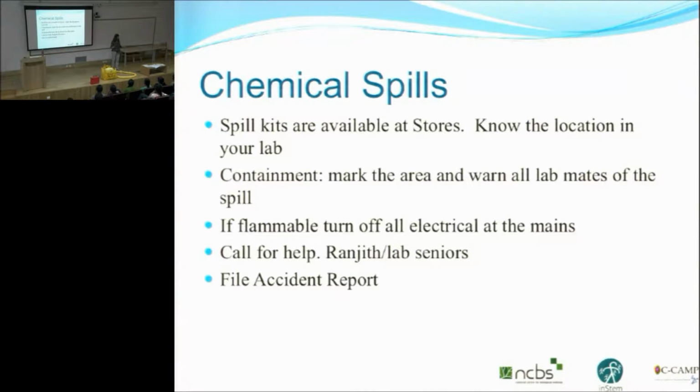You all are new here. I don't think you know how to treat a chemical. So you need to get help. Get a lab senior right away. Call the lab support office because they also have training on how to handle a chemical spill. But you might be the first responders. So you need to know that you need to mark the area so no one else can get hurt.